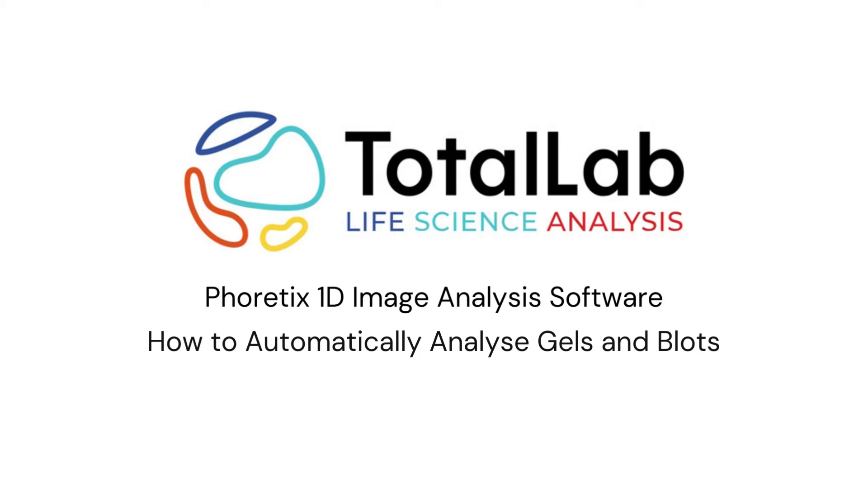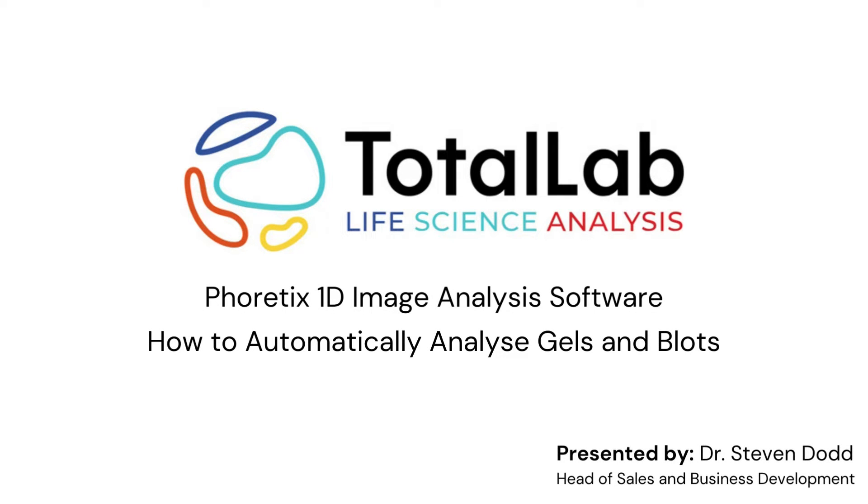Hello everyone. Today I'm going to be showing you how you can use the advanced automation features present in Phoretix 1D to speed up your gel and blot analysis and minimize inter-operator variability on your sites.